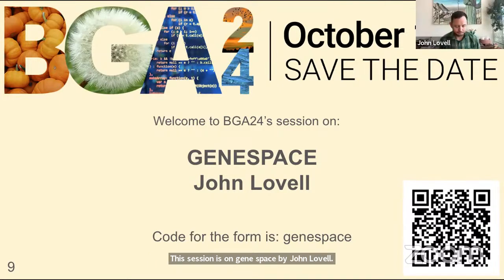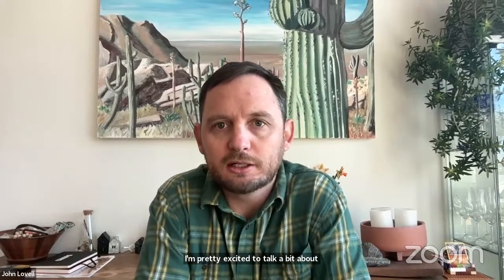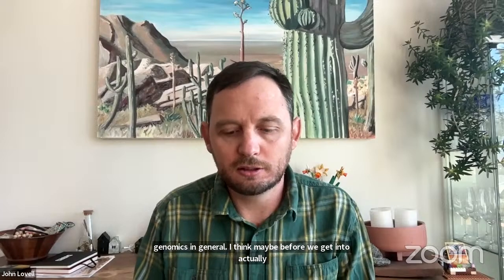Thank you. All right, thanks all for coming today. I'm pretty excited to talk a bit about my software GeneSpace and comparative genomics in general. Before we get into actually running the GeneSpace R package and producing our own results, I wanted to give a quick background on why we have GeneSpace and why comparative genomics is a really exciting field now more than ever.